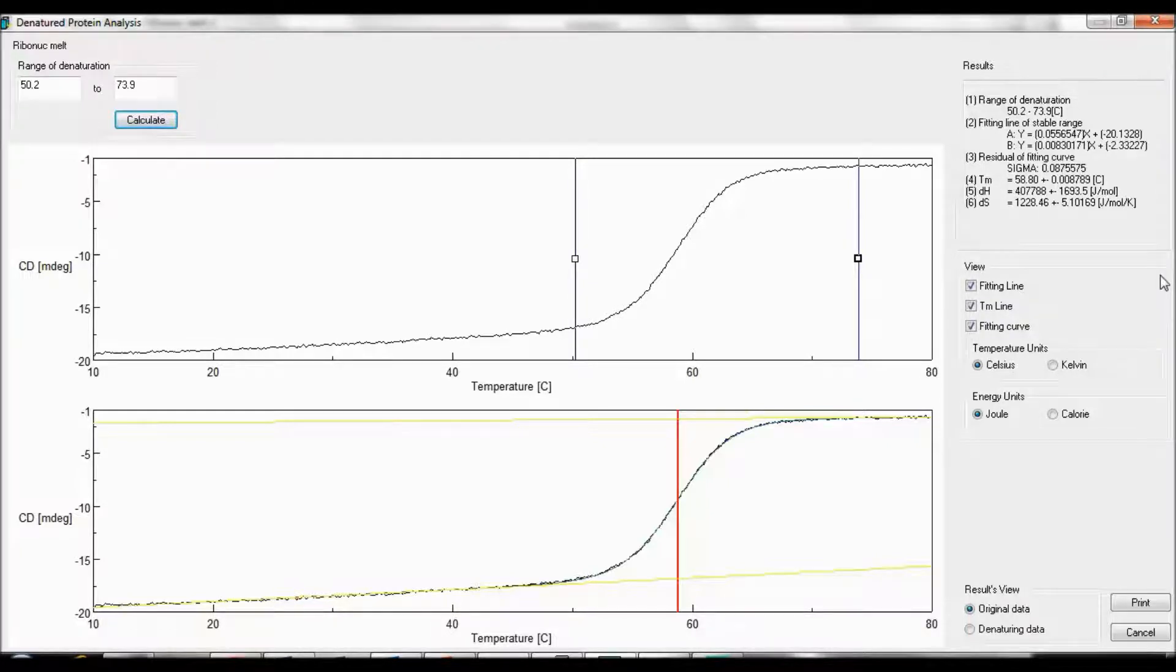The view options allow you to select whether you would like to see the fitting line, the TM line, or the fitting curve, which are all shown on the bottom figure.